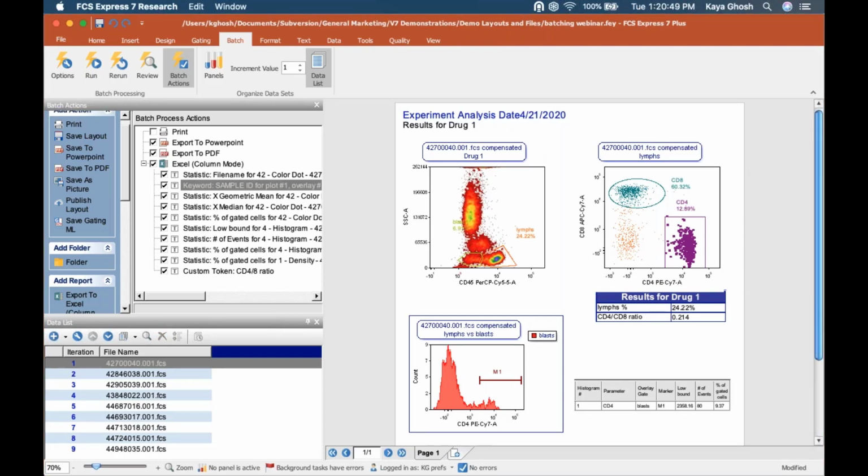Okay, so I see a question, somebody's asking, why do some iterations become inactive when you're working with FCS Express? That's a great question, and that's something that we can definitely talk about in the next section. So when I show the example of working with a control overlay, it's going to address your question. Even if that's not what you're trying to do, it will become clear, and I'll show you how to deal with that.